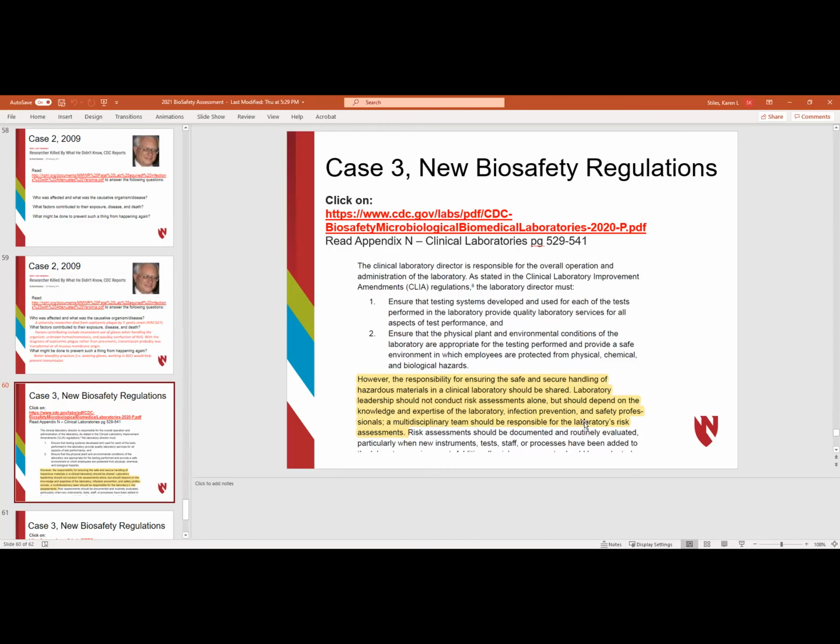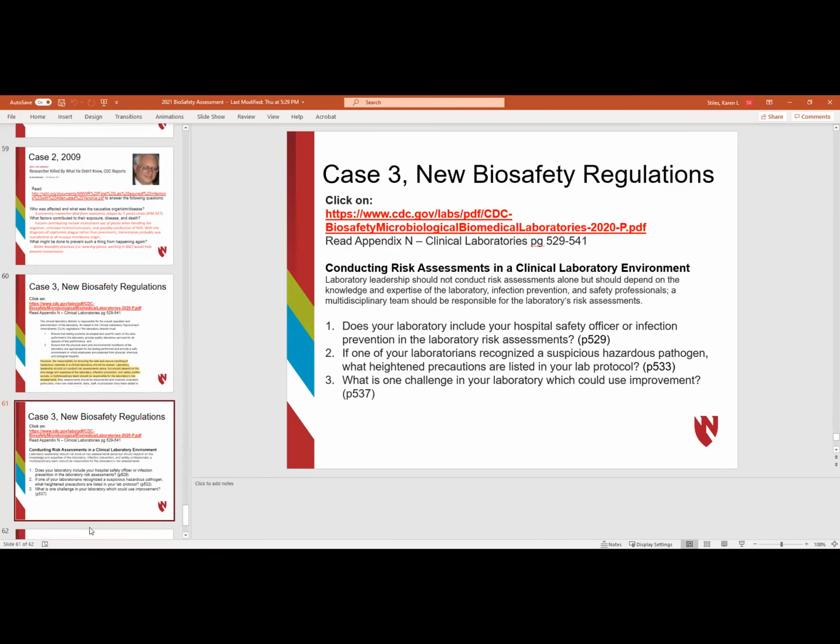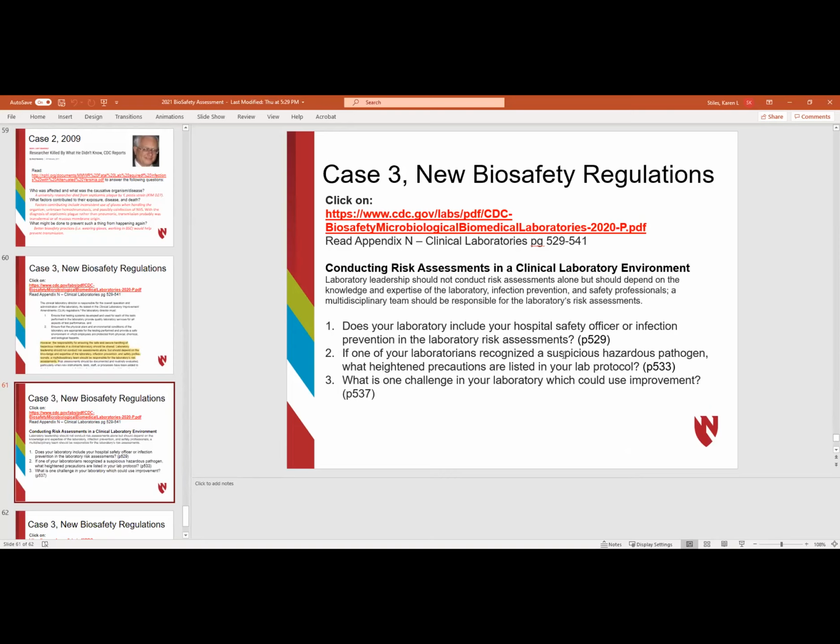And they want you to be sure that all of the people possible that could assist with your risk assessment sign off on that risk assessment as well. So it's a tough one, but I think that it's good to get a lot of people's advice on it, and it is good to know.